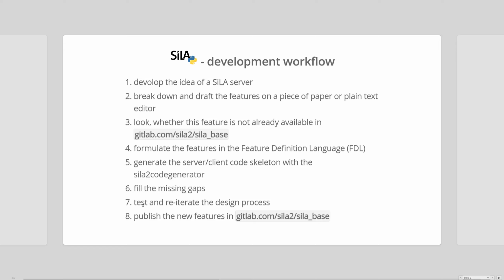Then you would test these implementations, reiterate the design process, and if you like your feature and think it's something useful for others, please feel free to publish your feature also on SiLA base, so that the amount of features grows and that we can speed up the development of SiLA by having many more features already specified and developed.